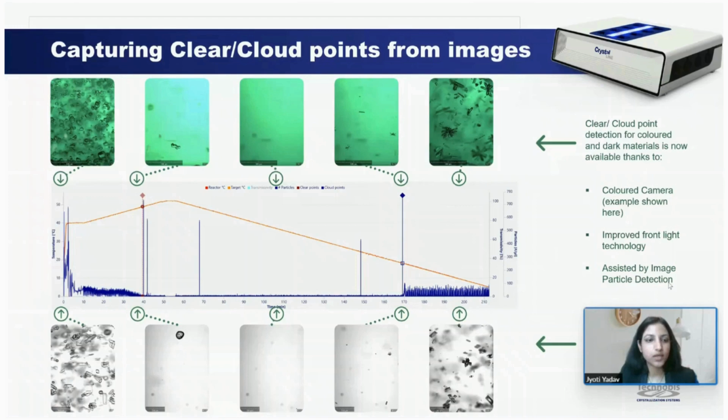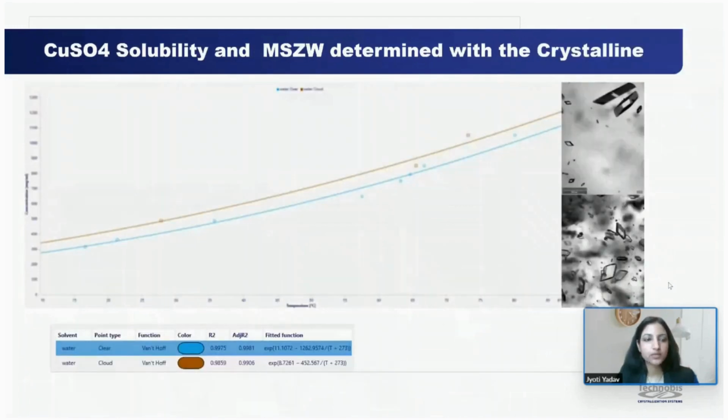So this is an example of solubility and the metastable zone curve determined from the images using the Crystalline instrument.